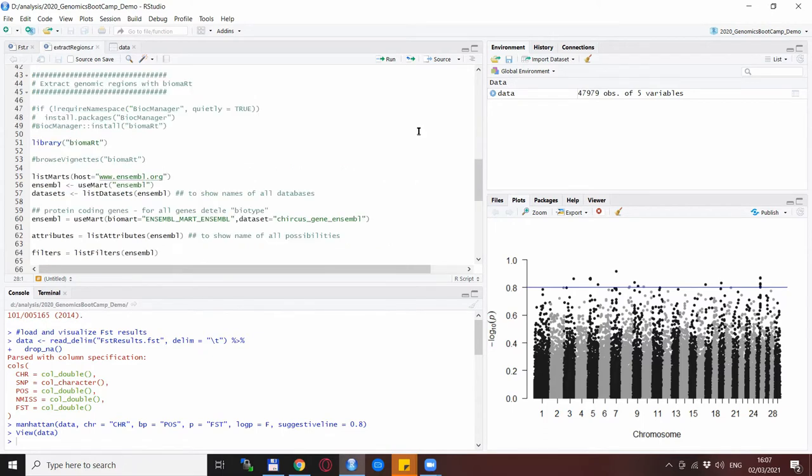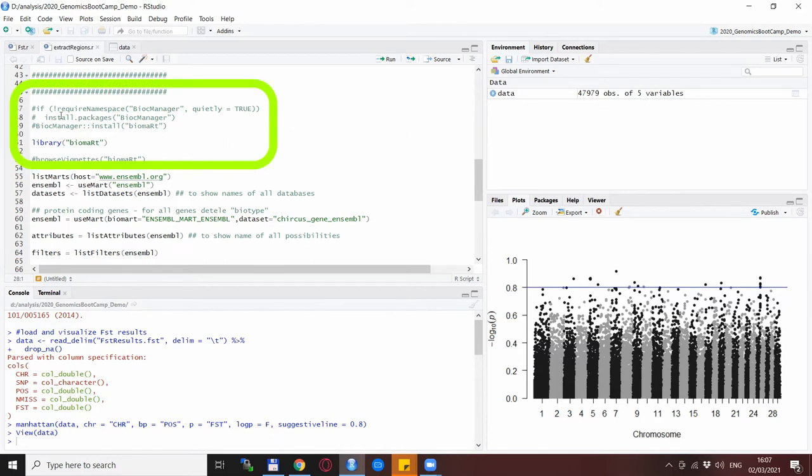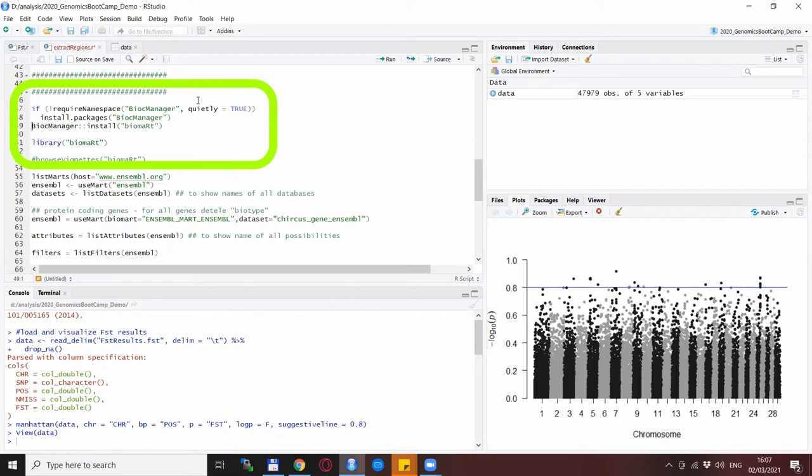We follow up with the Biomart software itself. You need to install this. I have it already installed so I already have this one commented out but it has a bit of a specific installation system so this is how you install it when you use it for the first time.